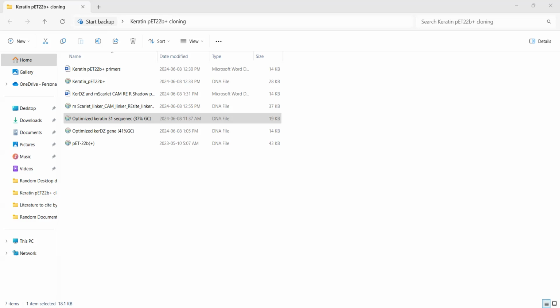What you could do now is play a little bit with these extensions. So I would go with reverse one. So let's see what we can get for a reverse. Let's try 30.